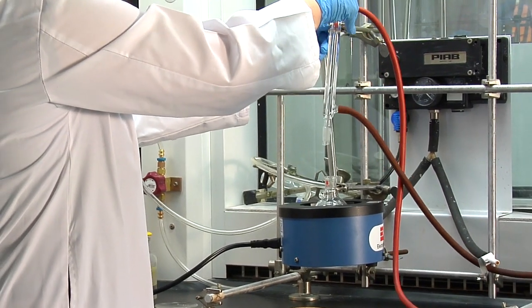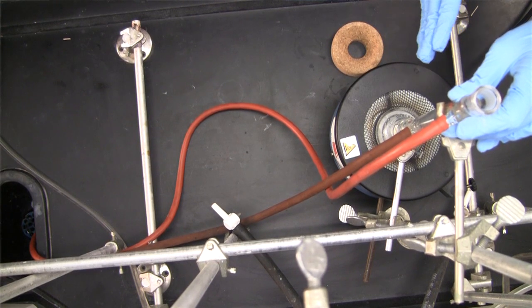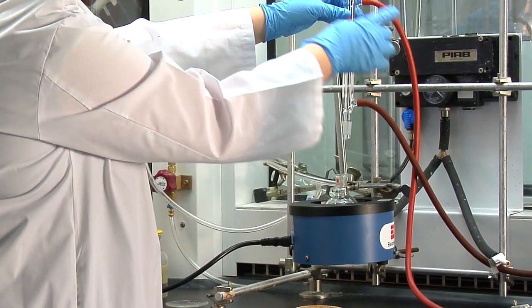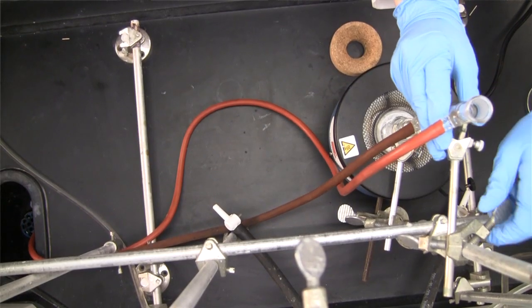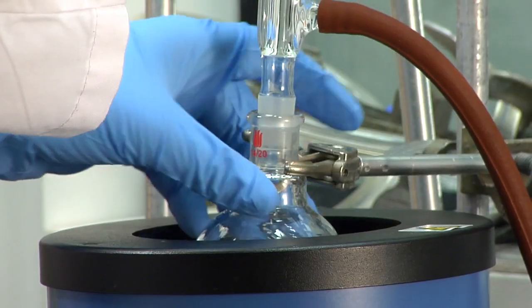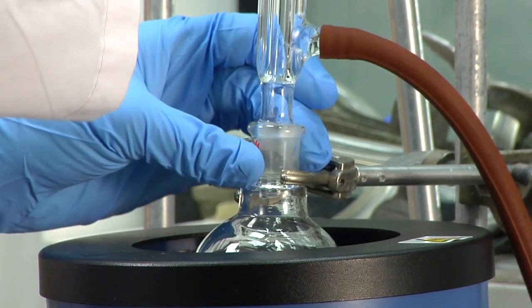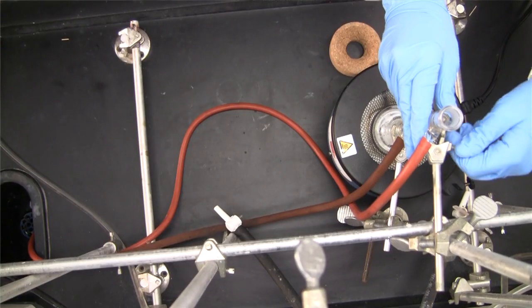So we're going to just redo this. And I already have it set up so that the water's going through the condenser. So again, the water comes in through the bottom and then out through the top, and you just need a slow trickle. So we're going to bring this down. You want to make sure that it's sitting there tightly, and we're going to tighten that clamp around the bottom.